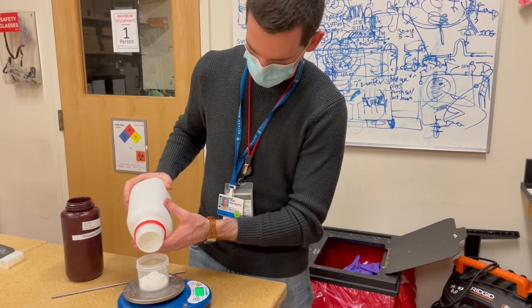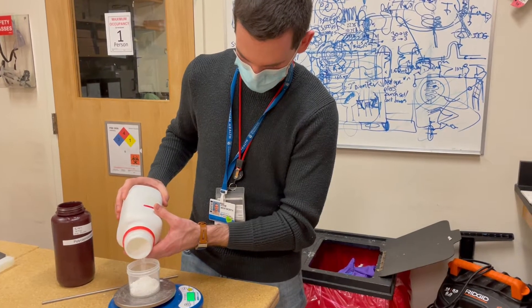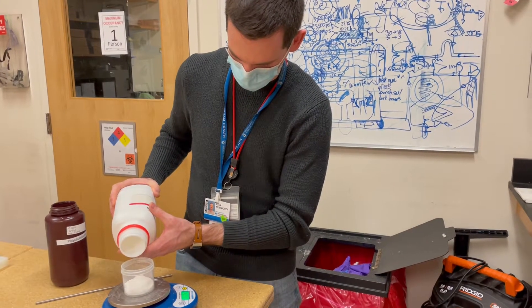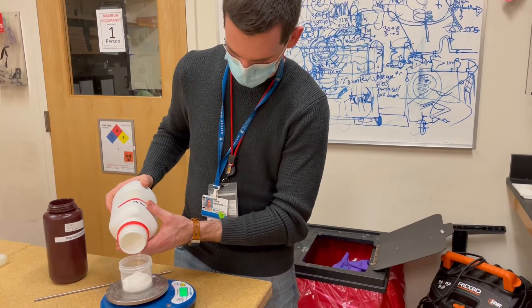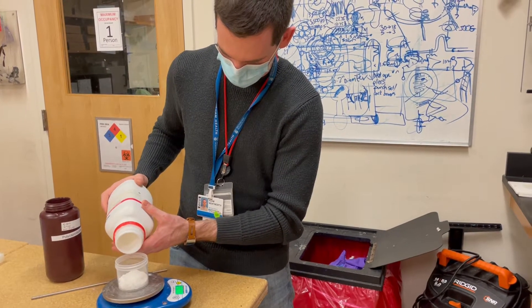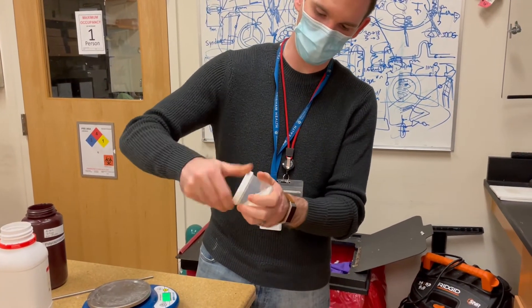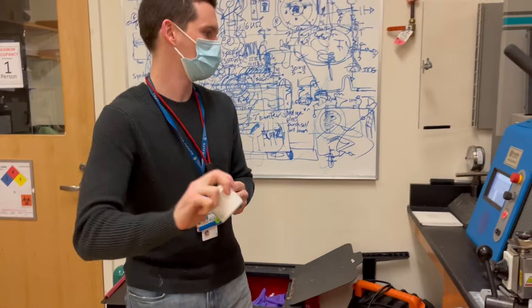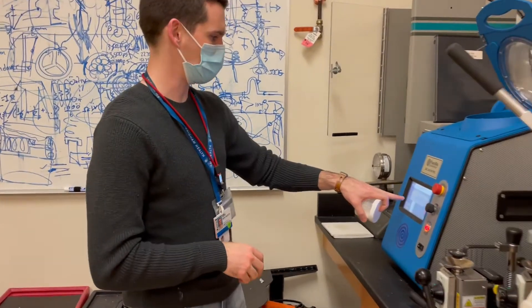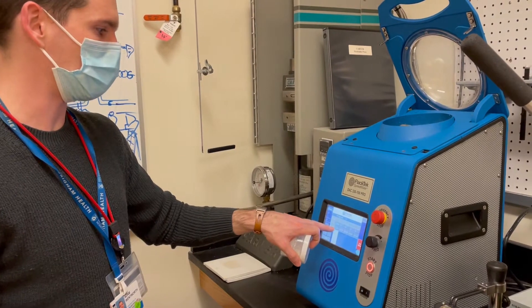This is the lazy man's way of weighing stuff out — just rotate and continue, as long as it doesn't come in big chunks. Then just screw on the top. The program we're going to run is program two, which is the max RPM for about one minute.